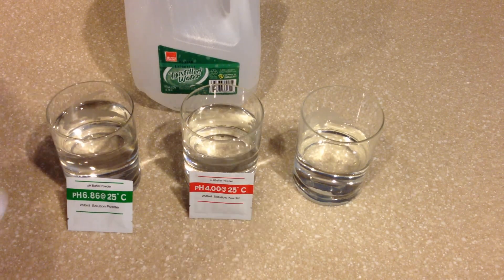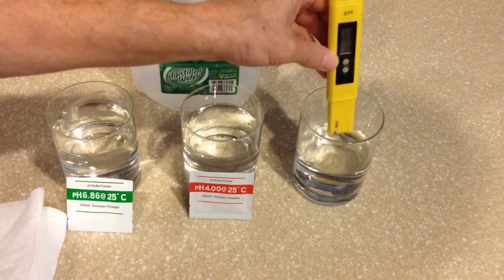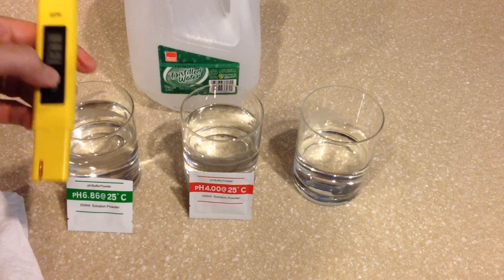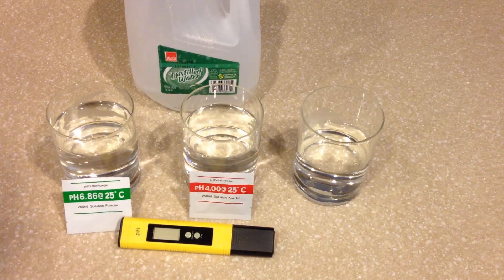It doesn't require a screwdriver, it doesn't require any tools at all, and it's completely one hand push button easy. That's the reason I like the RyzenTech digital pH meter. So we're simply going to turn it off, replace its protective cap, and we're done. That simple.